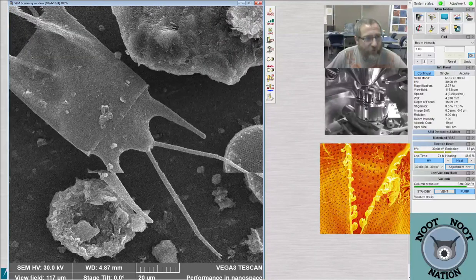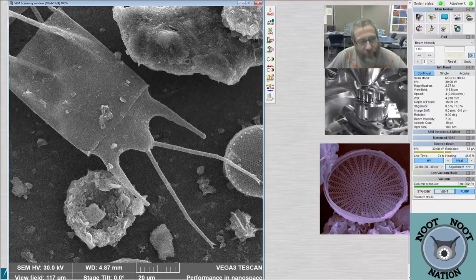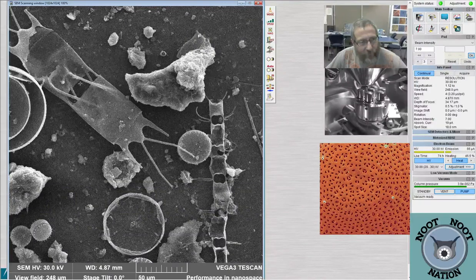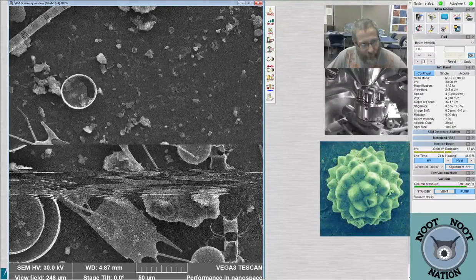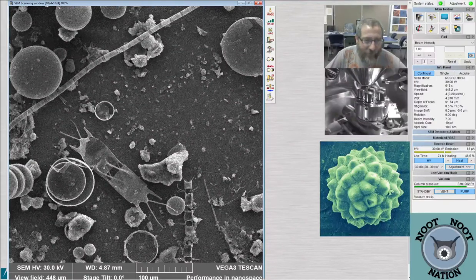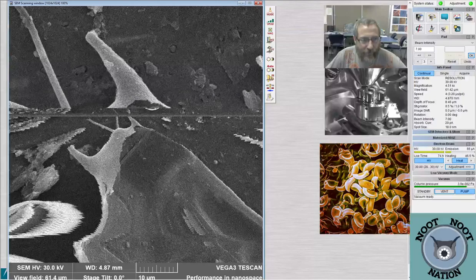It's got some sort of girdle band wrapped around it right here, and I think it was probably split pretty recently from another diatom, because the other half of the valve is right there inside the girdle band still. And then there's another connecting diatom over here, so maybe they make at least colonies of two. Or it's just dividing. Or it could still just be not completely separated yet. And this valve's actually cracked open up here, so if we zoom in, we can see a little bit of the inside of the diatom.